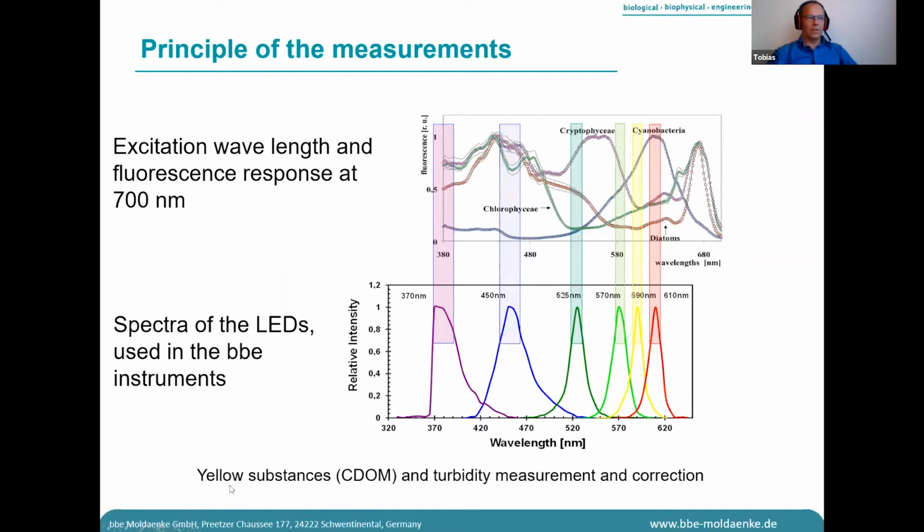And that's a very important thing: yellow substances, CDOM, and organic matter which has a fluorescence, we measure them and correct them, and we also measure the turbidity and apply a turbidity correction in these instruments.